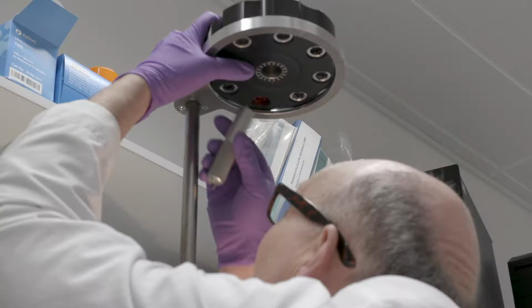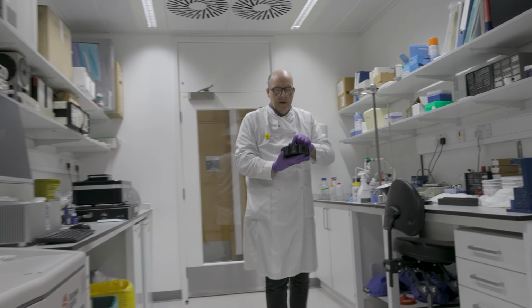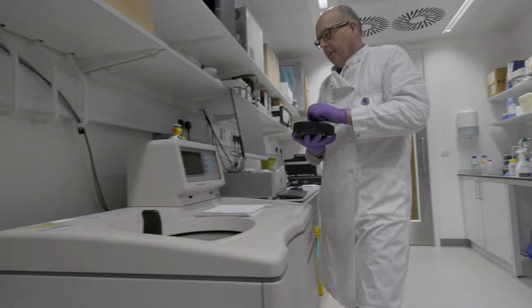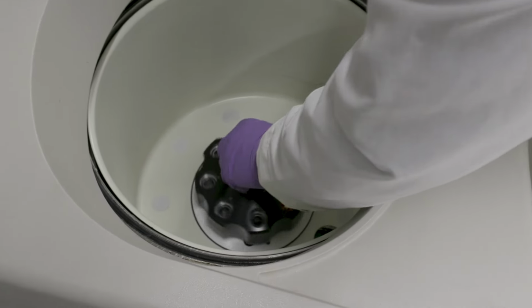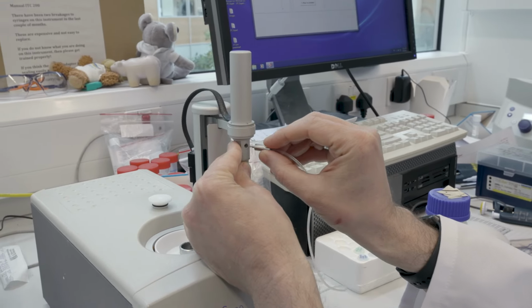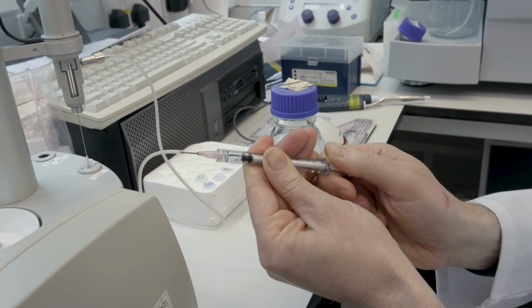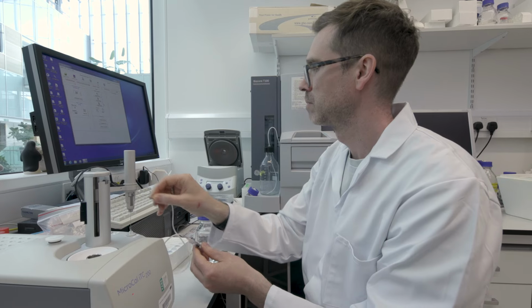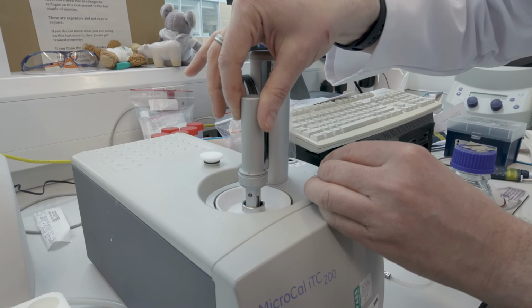We work with lots of groups within the LMB, and often the kind of questions we get asked is, you know, how strongly does something bind together? Does a multi-subunit complex stay together? What are their size and their shape? What are their mass? We've got lots of specialized instrumentation and trained people who know how to understand which technique is actually the best to use.